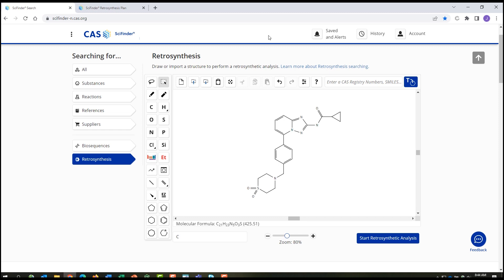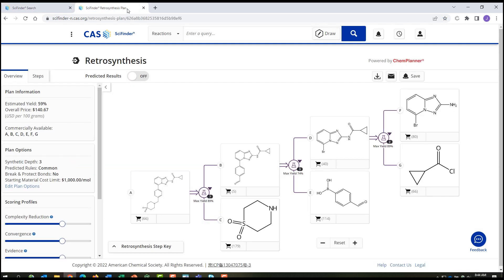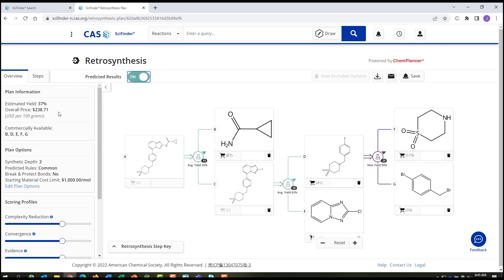The Retrosynthesis Planner within CAS SciFinder N will calculate an experimental synthesis and optimize for yield and cost. It also calculates a predicted synthesis based on known chemistry, using similar reacting centers that may be applicable for this substance.